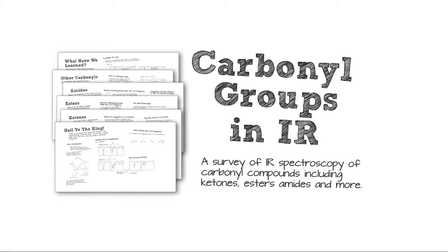Welcome to the king of functional groups in infrared spectroscopy, and that's the carbonyl group. I told you it was important, and we're going to see that it's a very clear, very strong signal, and the functional groups that contain carbonyls can be easily identified using the hints that IR spectroscopy gives us. So, let's start exploring.